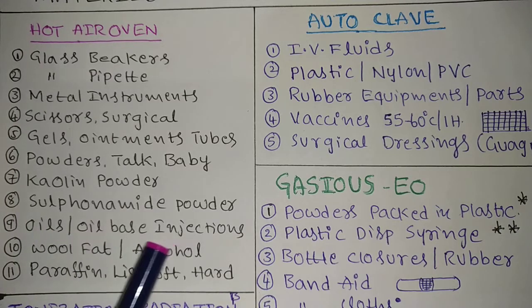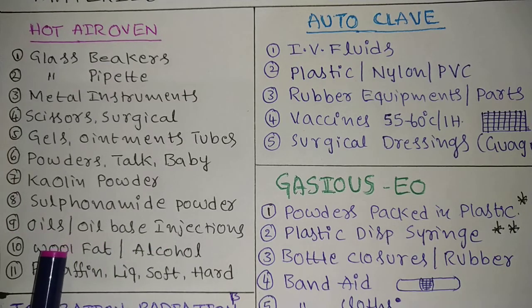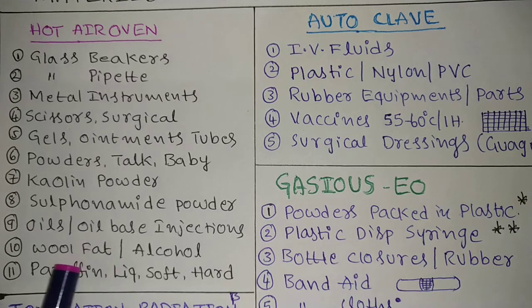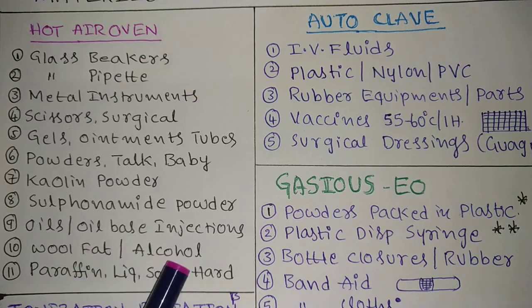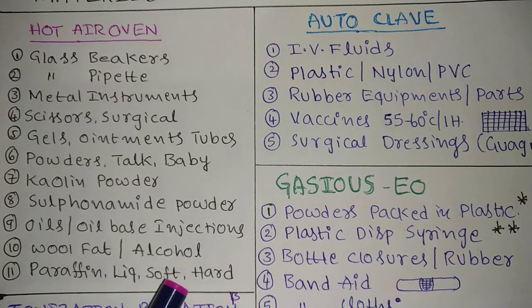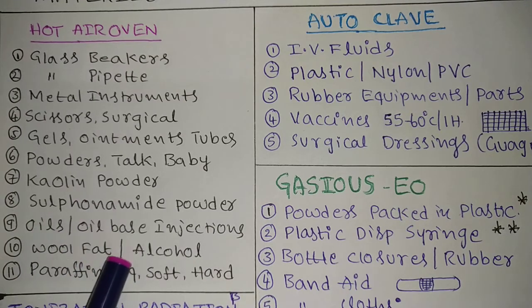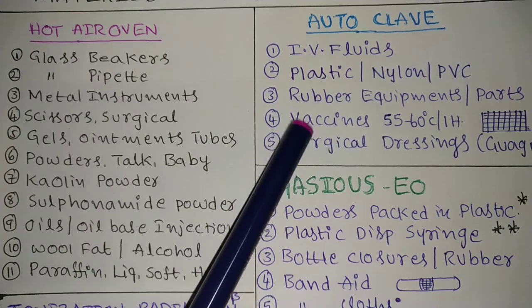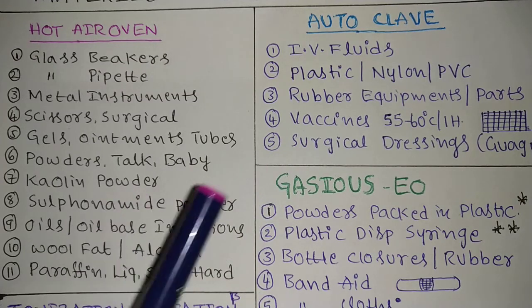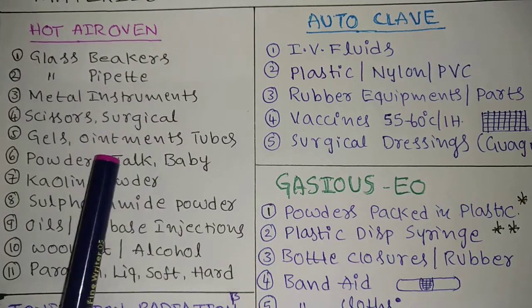Next are oils — oil-based injections, any type of oil items, wool fat, alcohol, paraffin (liquid paraffin, soft paraffin, hard paraffin) — all these oil items must use only the hot air oven. If oil absorbs moisture, there is a chance of emulsion formation. So do not go for autoclave; use the hot air oven for all oil-based items.